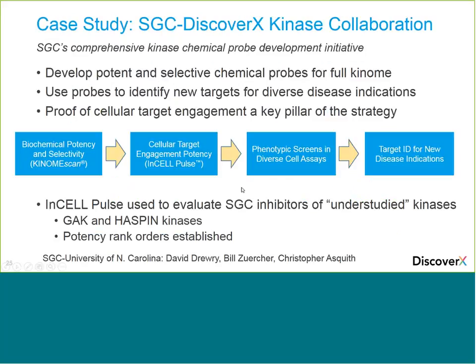So now I want to finish up with a case study. DiscoverX is collaborating around kinases with the Structural Genomics Consortium, the SGC. So the SGC has a comprehensive kinase focus at this time, where what they're trying to do is to develop potent and selective chemical probes for every kinase in the kinome.